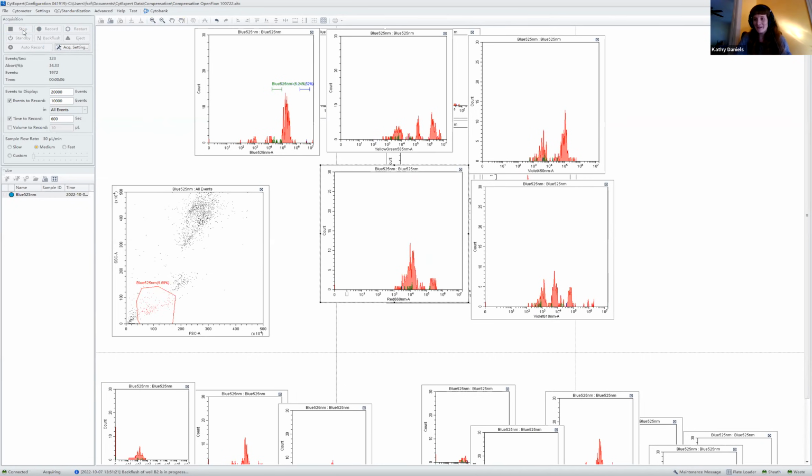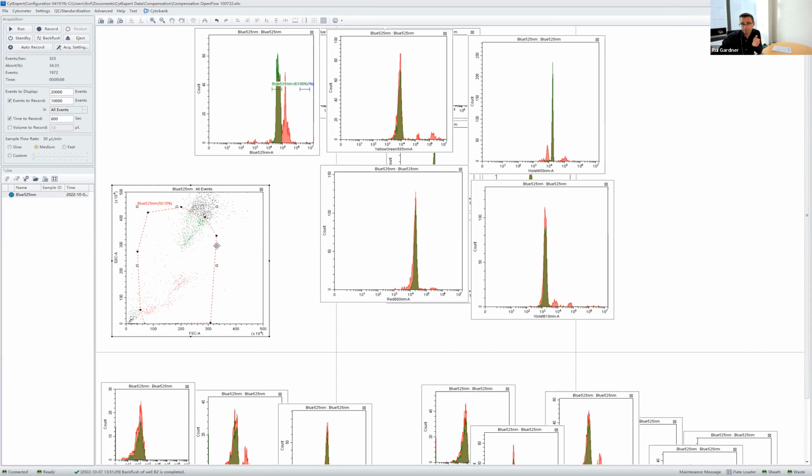And I see Rui has popped up again, so I'll let him interject. This is a good question because it has to do with how you're increasing and adjusting the gains. Somebody's asking if you can explain how you're able to move the peaks with no change in the x-axis values. How I'm able to move the peaks with no change in the x-axis values. They are changing, right? So how was I able to make that change to the visualization?